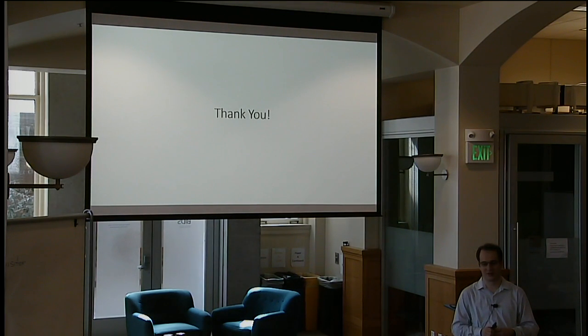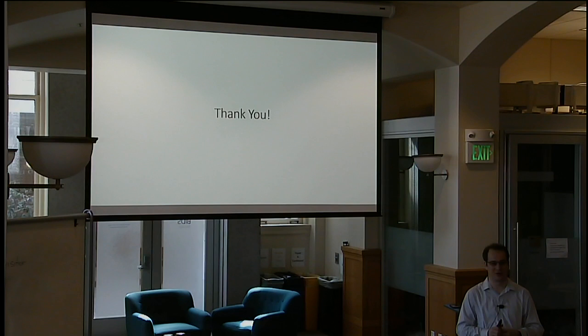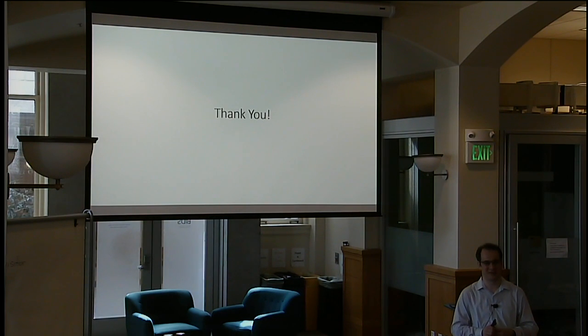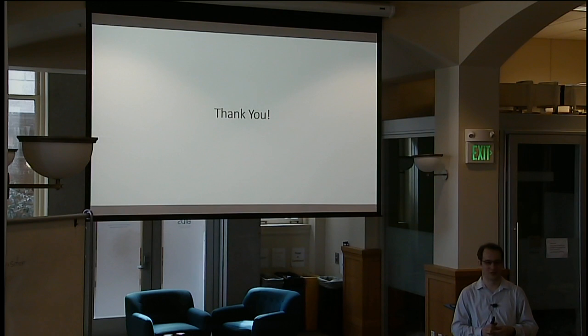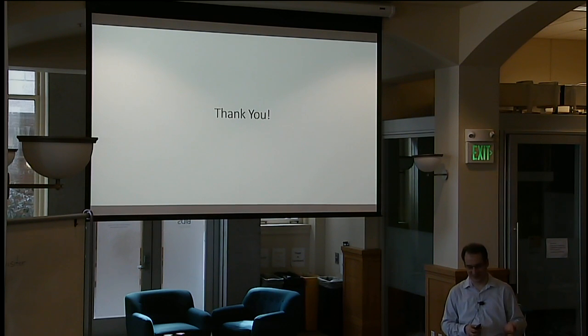So it's a good question. If you do it patch by patch, it will probably create extra atoms at the boundaries. It won't be super accurate, and you may confuse those boundary effects for some physical phenomena, right? So yeah, I always give long answers to short questions, but for the type of data that I showed you, we used 256 by 256. If an image was larger than that, I downsampled it.